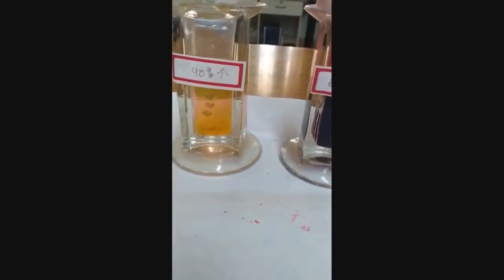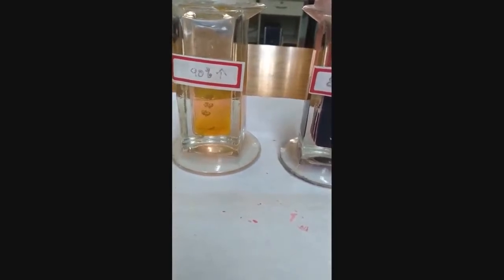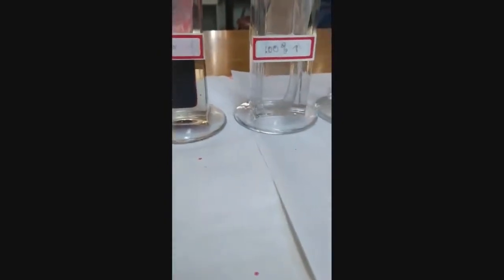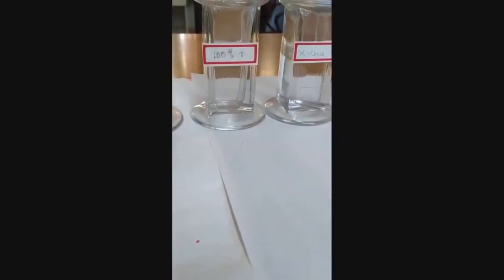2 minutes later, take out the slide from 90% alcohol and then process it through 100% alcohol and xylene, keeping in each for about 5 minutes. After processing through xylene, we have to mount the slide in DPX. Add a drop of DPX with the help of a glass rod.